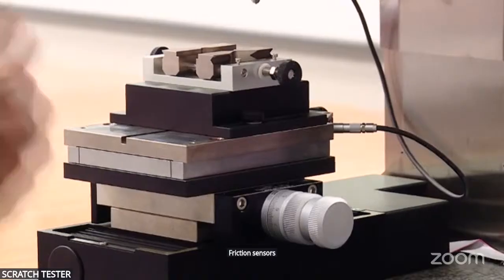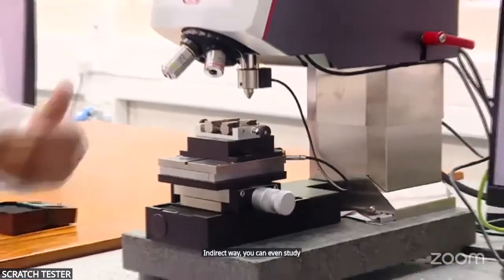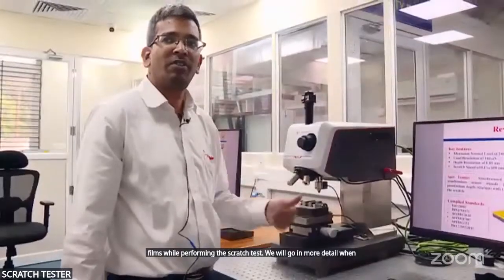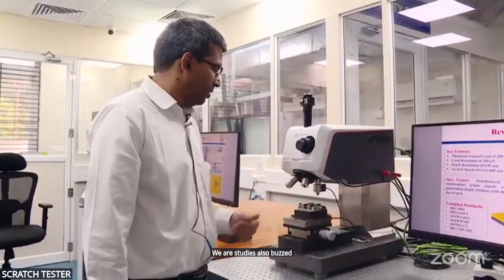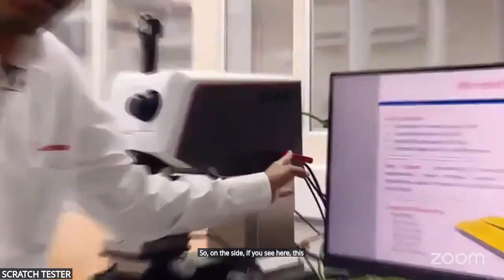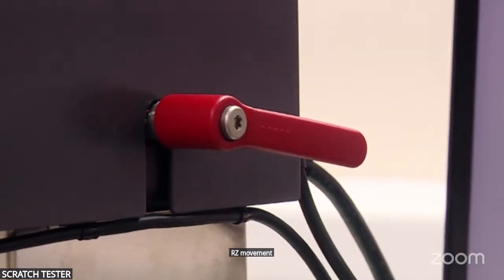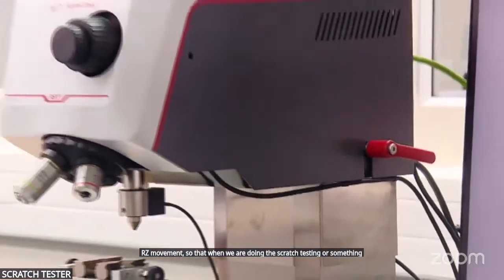Because of having the friction sensor, in an indirect way you can even study the wear of the films while performing the scratch test. We will go into more detail when I show you the software feature, how we can do the wear studies also by just using the scratch testing. On the side, if you see here, this red knuckle is basically to lock our Z movement, so that when we are doing the scratch testing, nothing moves.